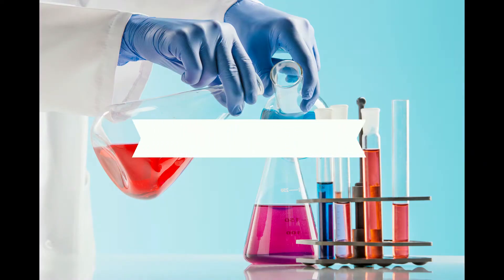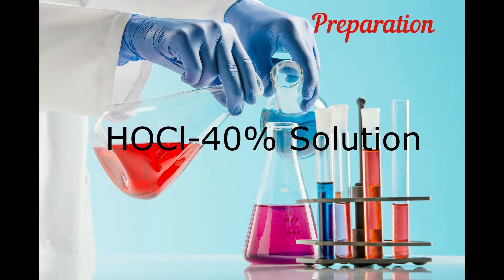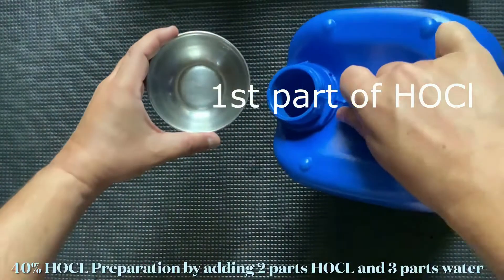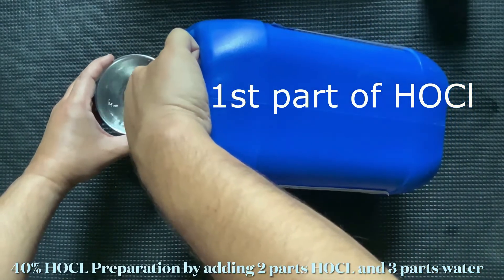Let's check the concentration of HOCL by preparing a 40% solution. It can be prepared by taking two parts of HOCL into a utensil.